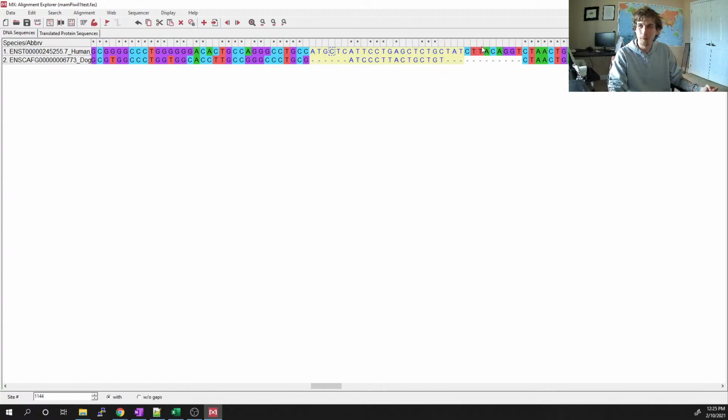It's just that whenever we try to annotate a 13 or 14 exon gene over a span of 100,000 bases, one of those exon annotations is going to be wrong, at least. Or it's going to be only partially right. So regardless, we have a very clean alignment for the rest of this, except for this little bit of gappy stuff.